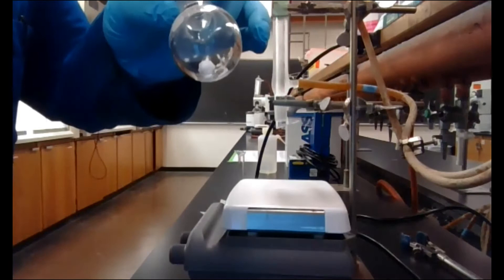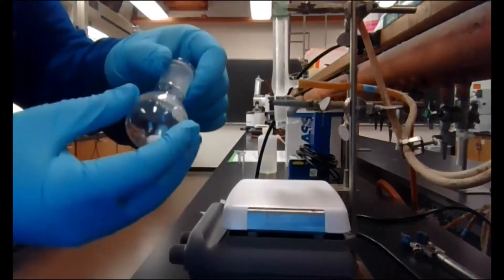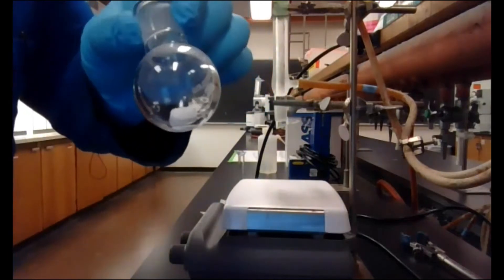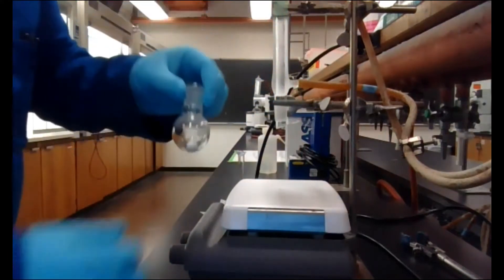I've already added in 150 milligrams of the NEM. It started out as a clear colorless crystal, but it melts at room temperature, so as soon as I added it to the round bottom, it melted, and then there's a stir bar in there.